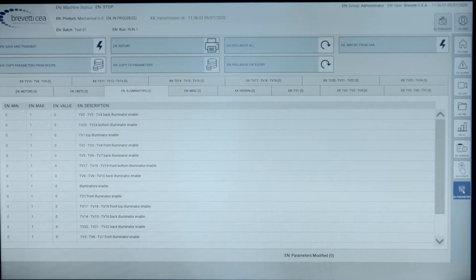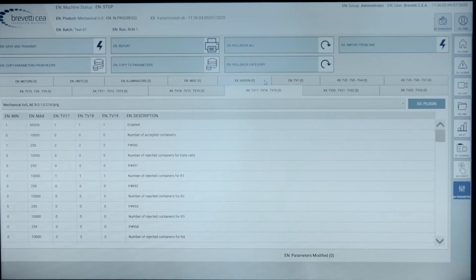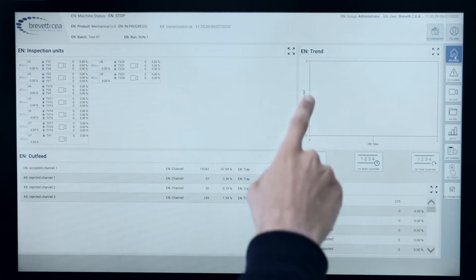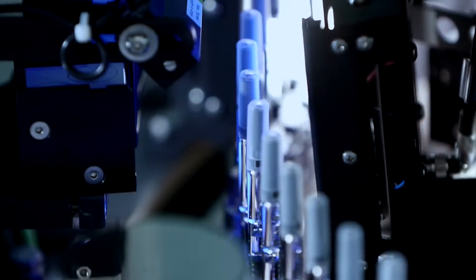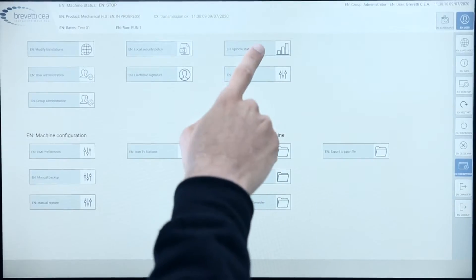A single intelligent proprietary HMI permits the complete overview of the machine. Flexible and intuitive, it simplifies equipment use and reduces operation time.